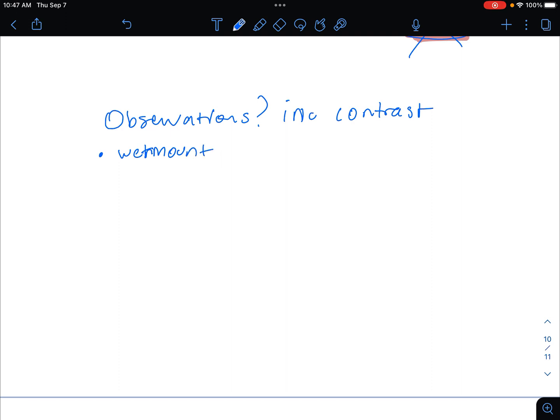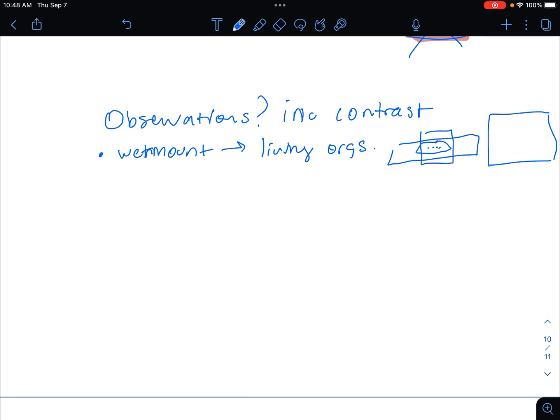And this is for living organisms. You just basically take a slide with a liquid sample of the organism, and then you put a cover slip on, and then on certain light microscopes you could actually change the contrast, and then you could get an actual image of whatever you're looking at pretty easily.